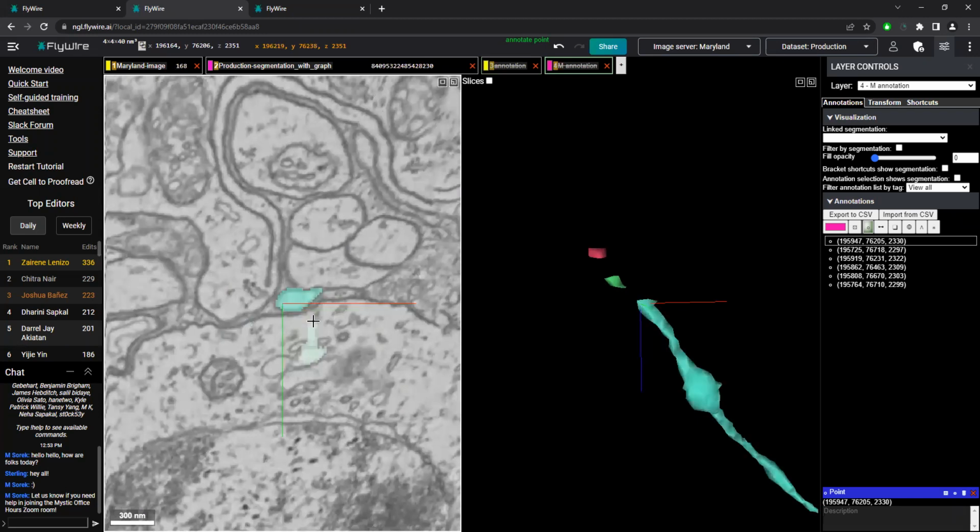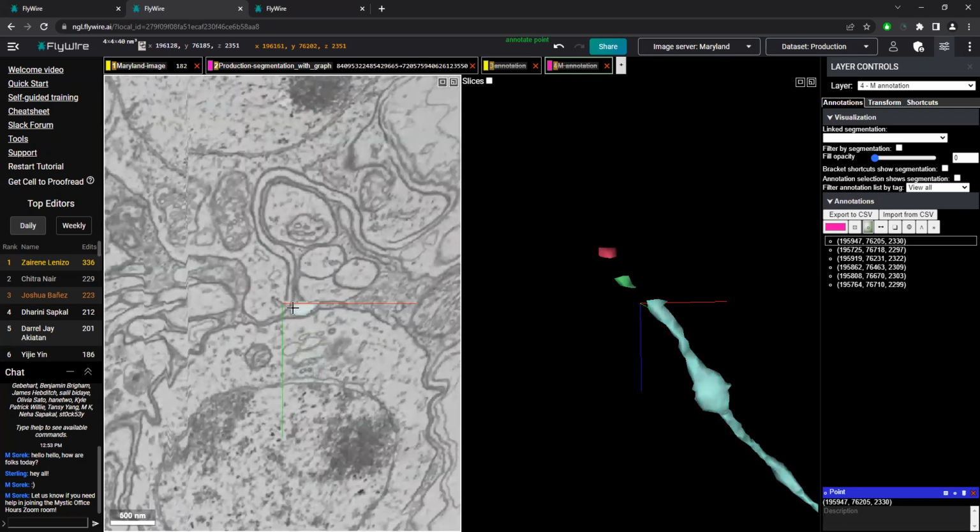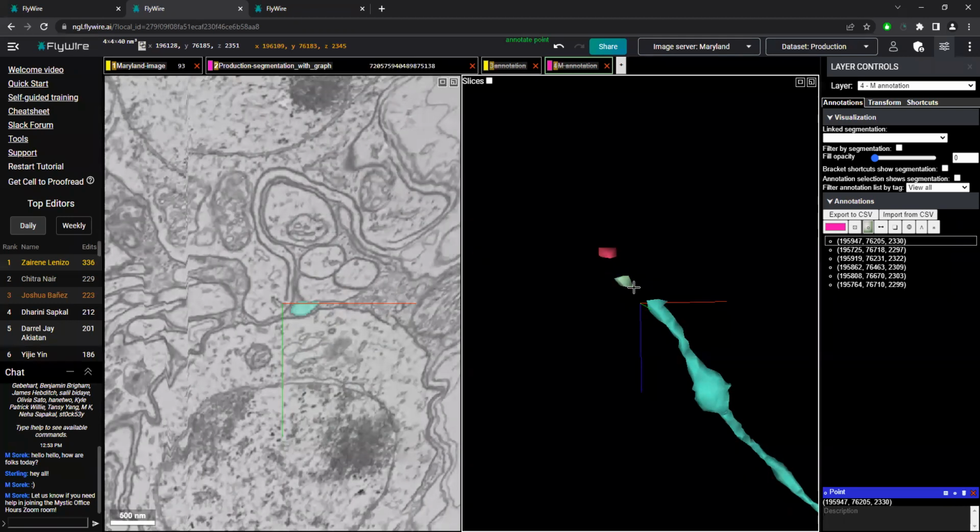piece right here? The nice thing is that this small piece we know is related to this little almost face with these kind of like frog googly eyes. But these three neuron branches here are pretty distinct, and we know that it's nestled right underneath it. And we also know it's above this large cell body here, this soma. So that gives us some points of reference for where we want to go as we move along.